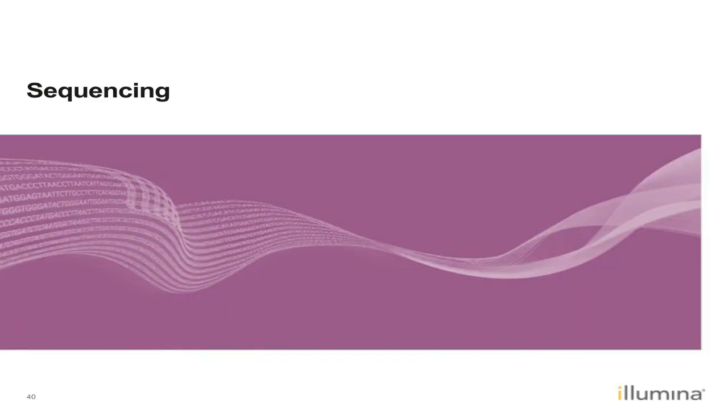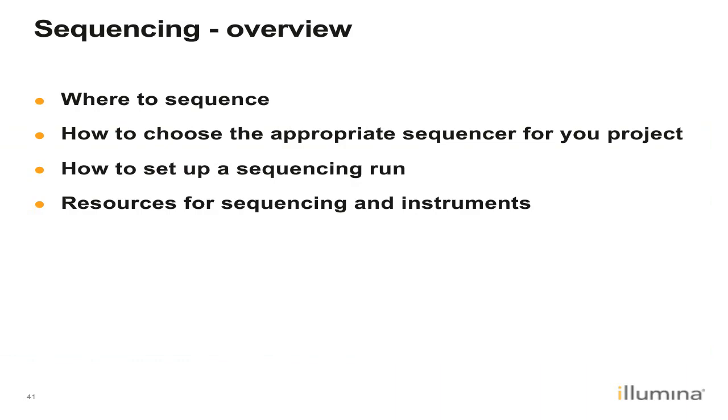Now that our libraries are prepared and pooled, we'll go ahead and proceed with sequencing. We will discuss where to sequence, how to choose the appropriate sequencer for your project, how to set up a sequencing run, and resources for sequencing and instruments.